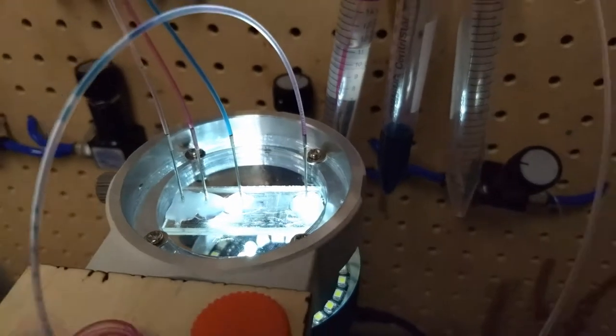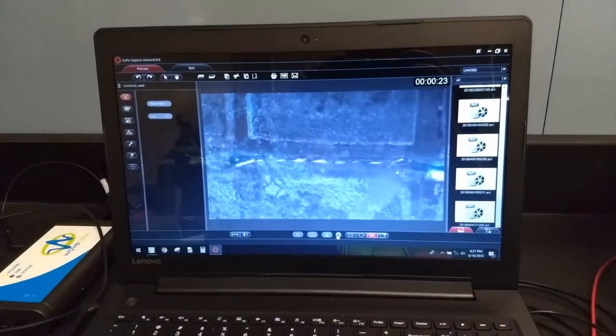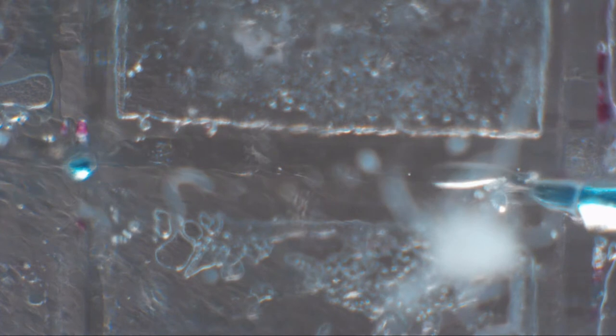I'll adjust the camera a little bit to get a better view. Through the microscope you can see blobs of water coming off in the oil — and there's an even clearer view of it. So this makes micro-sized droplets of water in oil, and we're using that for a whole bunch of things in other projects.